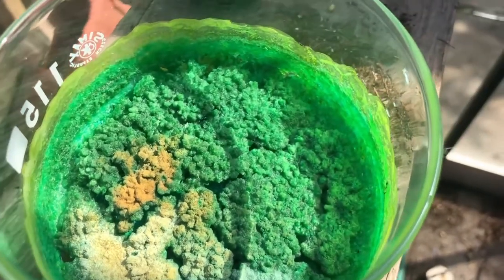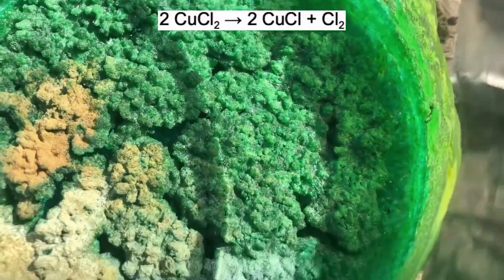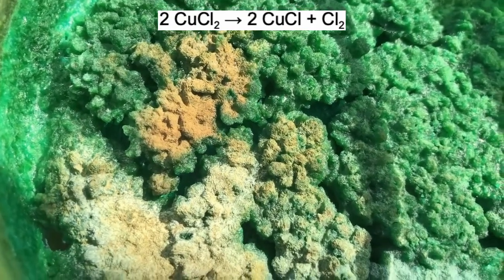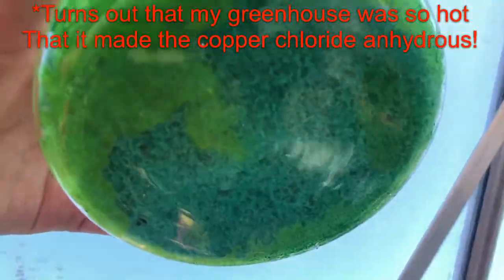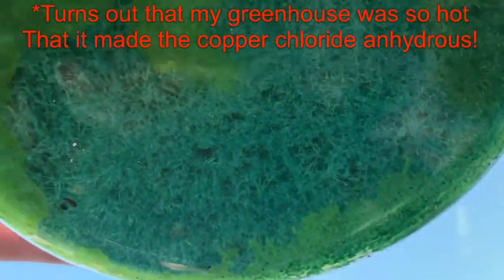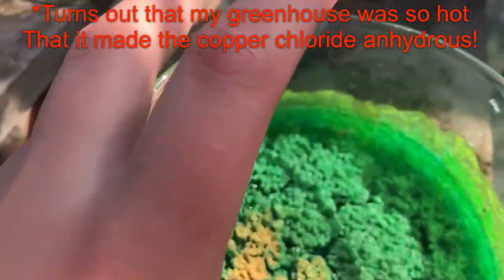Seven days later, after leaving it to dry, this is what remains. The top bit is actually copper chloride which has decomposed and released chlorine gas. That brown bit is the anhydrous copper chloride, and at the bottom there is copper chloride that hasn't decomposed yet. The anhydrous copper chloride can easily be turned back into the hydrous copper chloride by leaving it outside in a humid environment.